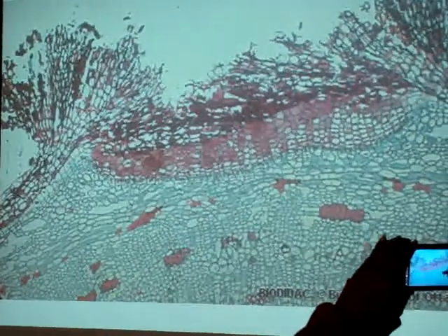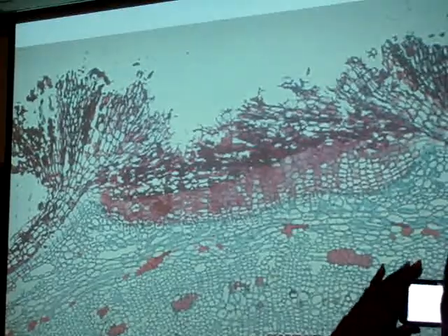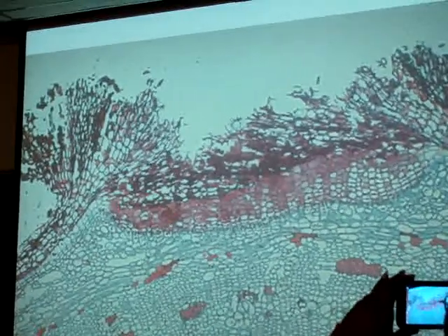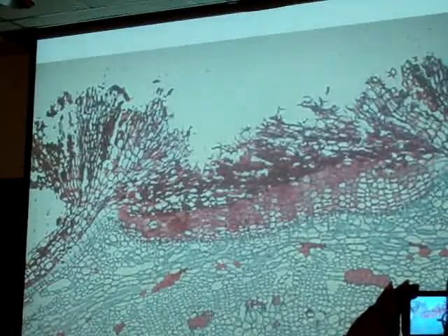All right. And now you have a very specialized reason why you're looking at this. Why are you looking at this? Lenticel. Is that a soup? Where's my bread? No. What is it called? A lenticel. So you had one very specialized slide, 56. There's only one reason why you look at this. What's going on here? Gas exchange.